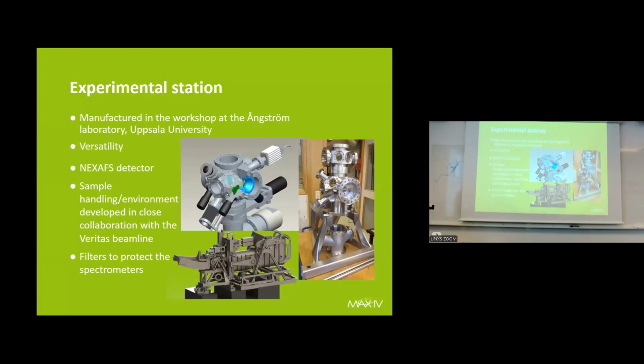Again, the experimental station there is built so it can house both those spectrometers, and it's versatile, so we can do liquid jets and things like that there as well. That we do at VERITAS. Anything we do at VERITAS, we should be able to do here.